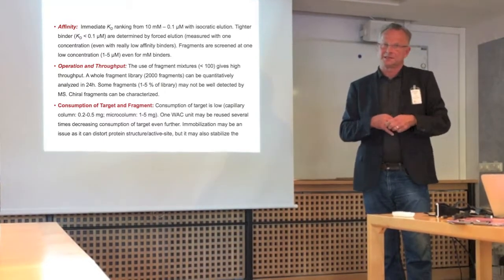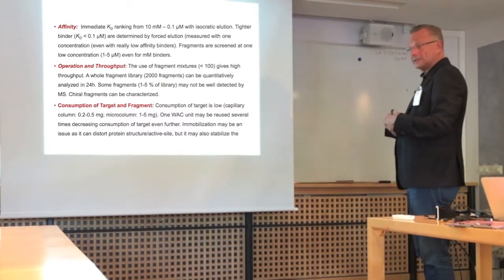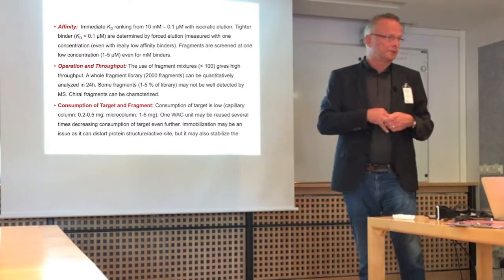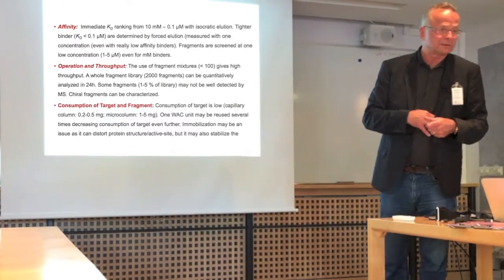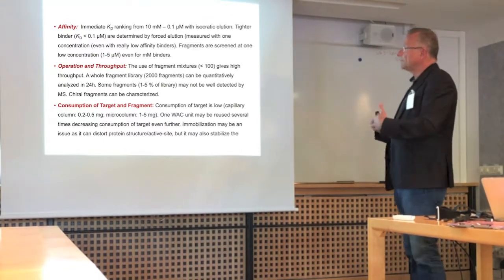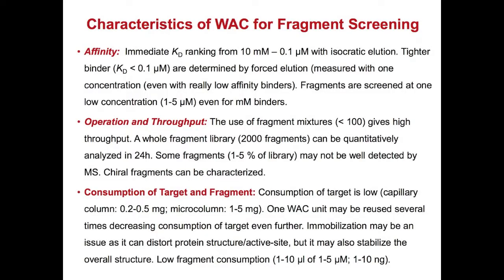You're going to change it, and maybe you're going to lose activity. And that's true, it happens. I had cases where I had not been successful really to immobilize it well. But it's quite rare. So to compensate for that, you can reuse it a lot. I have an antibody column that's more than 10 years old and it's still running.